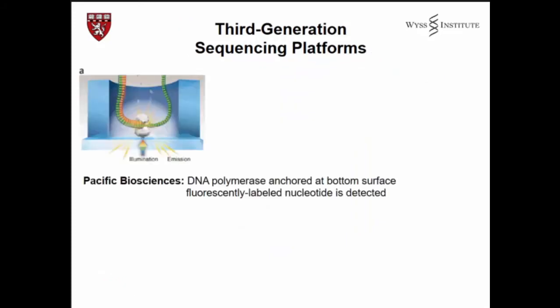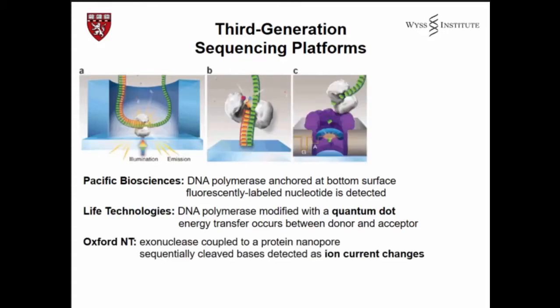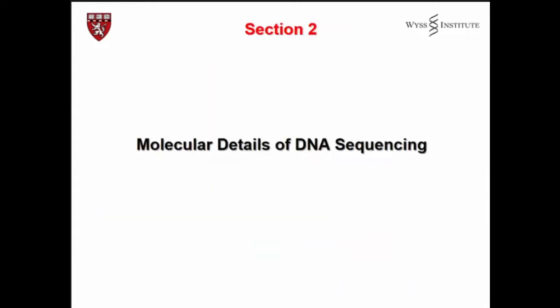Just giving you a survey here on current 3rd generation DNA sequencing techniques. And what I'm trying to point your attention to is that a physical sensor in an array setting is typically coupled to an enzyme which performs some kind of function. For example, sequence DNA in this particular example. But you can imagine that could be any other enzyme which actually processes DNA. And there are many of them. One of them is also Cas9. And I will show you in later slides how I'm envisioning this technique.